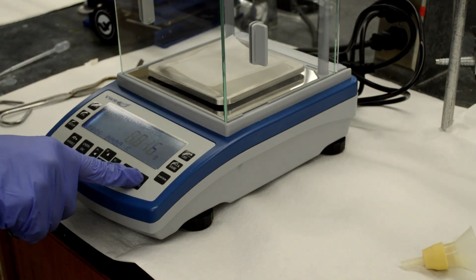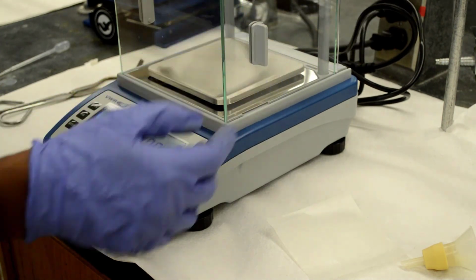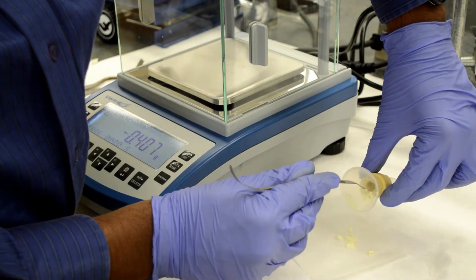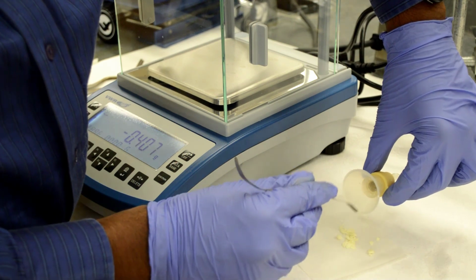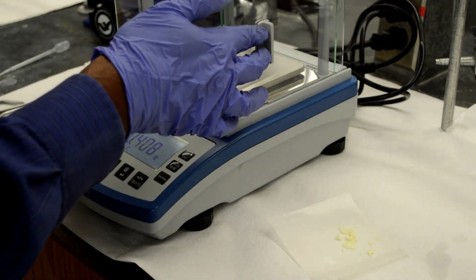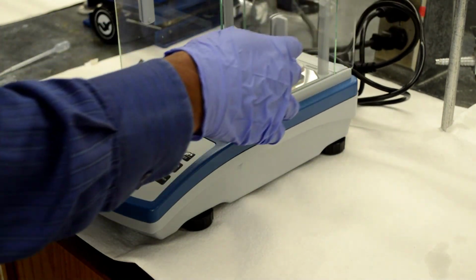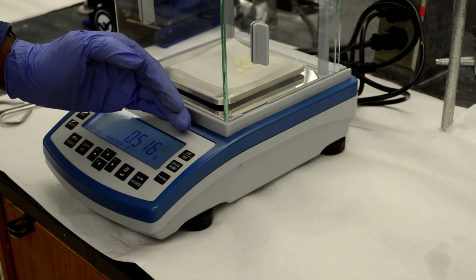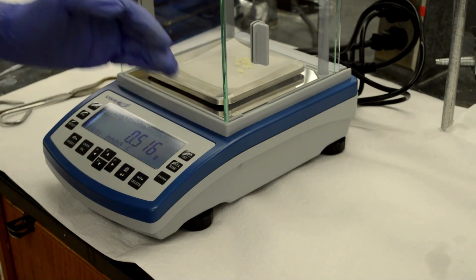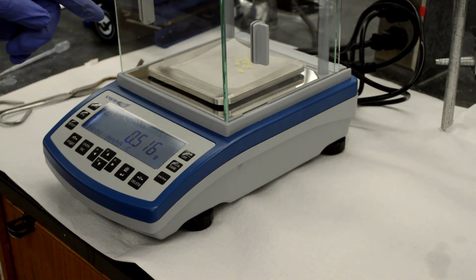Zero down the weighing paper. Transfer the crystals onto the weighing paper. So these are pure product. And check the weight of the pure product. The weight of the pure product is 0.516 grams. The next step is to check the melting point of this product and the NMR spectroscopy of the product.